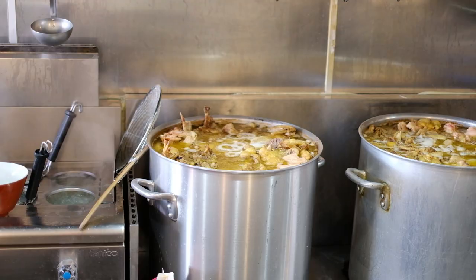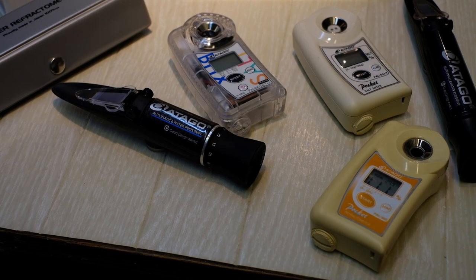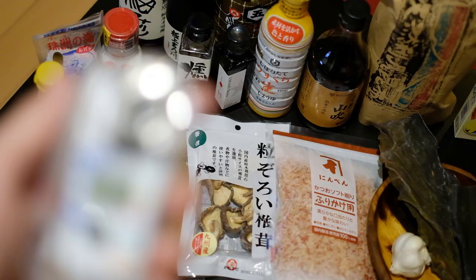For ramen, we are most concerned about the salt percentage and the thickness of the soup. In the past, you'd use a separate salt meter and an analog refractometer to measure the soup's thickness, called brix.